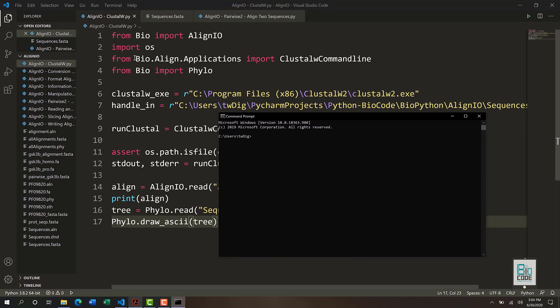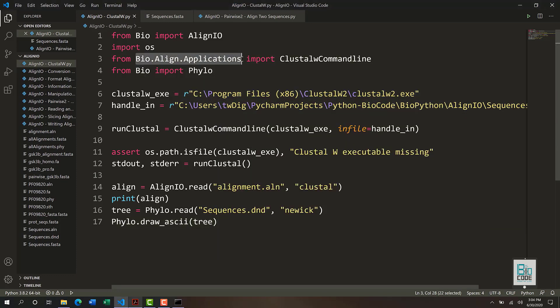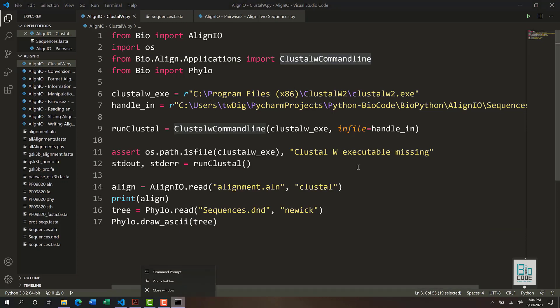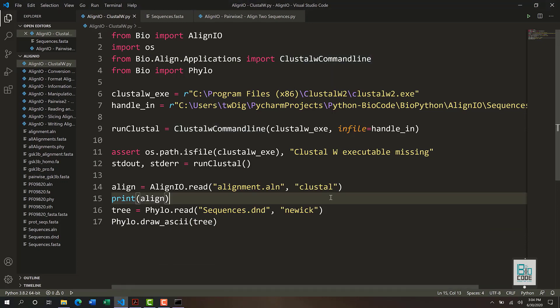Within BioPython there is a package — the Bio.Align.Applications module — which has a ClustalW command line wrapper. This Python wrapper allows us to connect our Python code to the ClustalW command line software, or ClustalOmega software, so that we can use Python to execute the alignment within ClustalW.